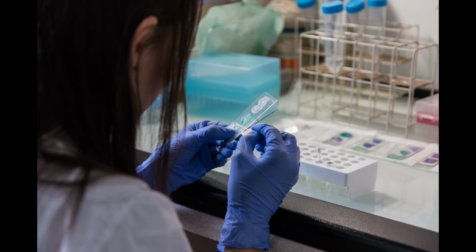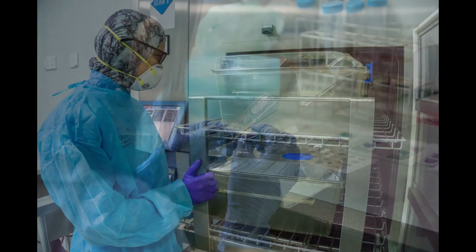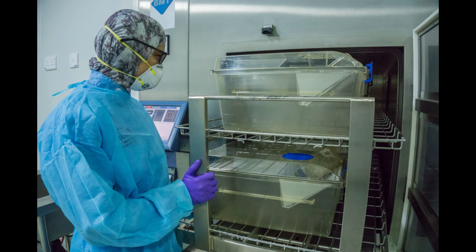Biosecurity Level 2 is also used in the case of genetically modified organisms for the most part. This is generally accepted as the minimum for a genetically modified organism. The reasons are simple. The access to the facility is extremely limited, especially when work is being conducted. That allows for not only containment of the facility, but also there's restricted access, which means people aren't likely to bring in or take out anything pathogenic or that shouldn't spread its particularly modified genome around.